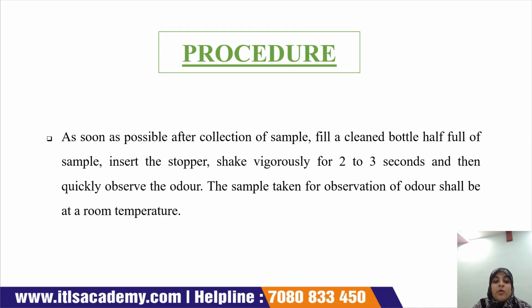Now the next is the procedure. Again, as soon as we collect the sample, we have to perform the experiment. Otherwise it will affect the quality of the water.